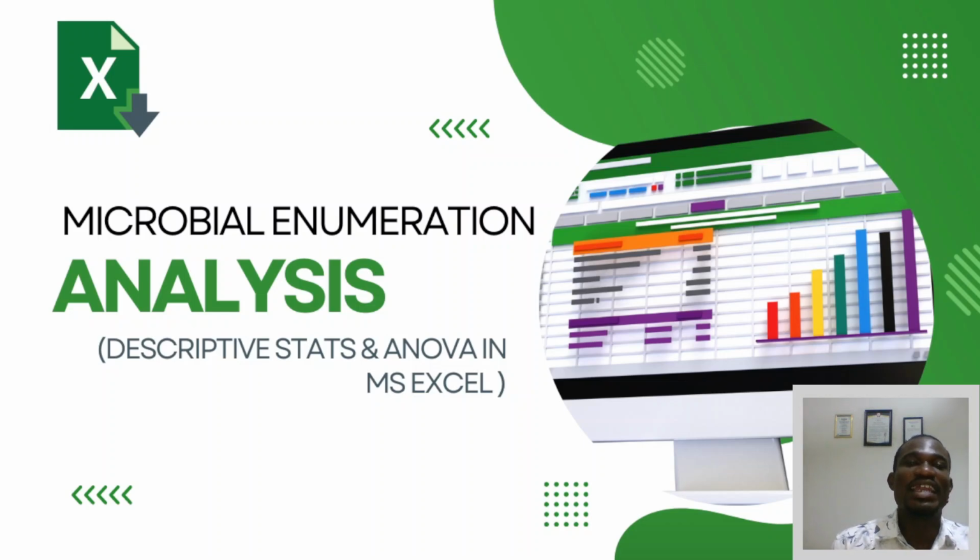If you are analyzing your data at 95% confidence, which is what we normally use in our educational setting here, then once your p-value is less than 0.05, it indicates that indeed there is a difference between your batches or between your different samples. However, when your p-value, or your significant value, which in some applications you see as SIG, is greater than 0.05, then it means that there is no significant difference between the batches or between the sample variants that you have analyzed when you are looking at your data sets statistically and not just with the numbers you are seeing.